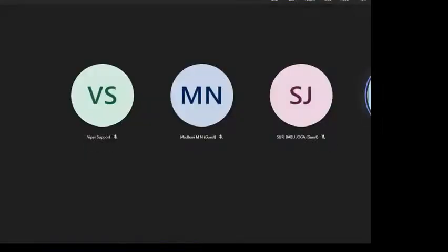And here also, for the entire instrument handling, the entire data, whatever we are doing, when you log in, when you log out, everything will be saved in the Waters dedicated server. For example, this is a Shimadzu.